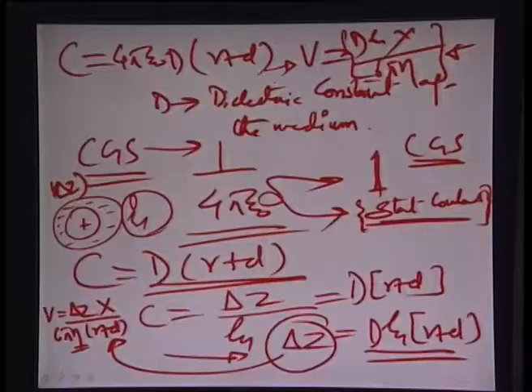And essentially the mobility is also defined as the velocity per unit electric field. So if X is 1, then the mobility in this case would be D zeta by 6 pi eta. D is the dielectric constant, zeta is the zeta potential of the ion counter ion combination, and eta is the viscosity of the medium. Okay, so all said and done, this is what the electrophoretic velocity or mobility would be defined as.